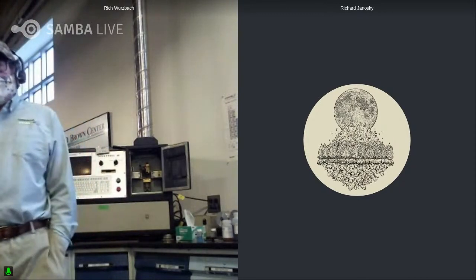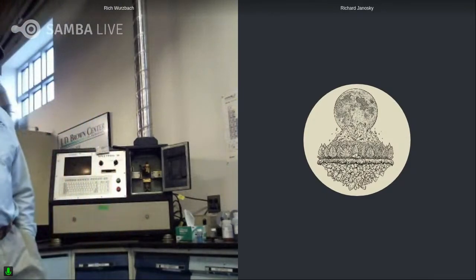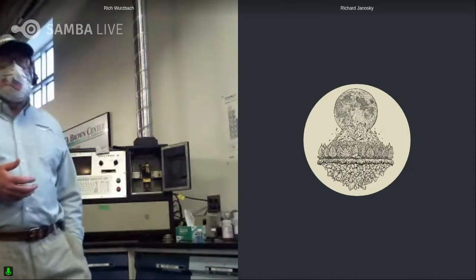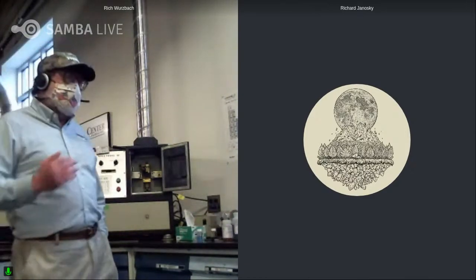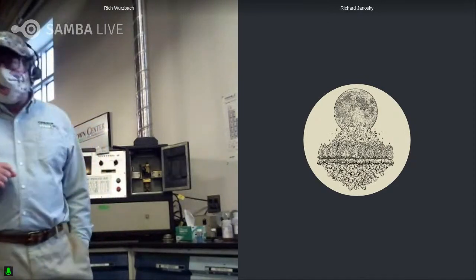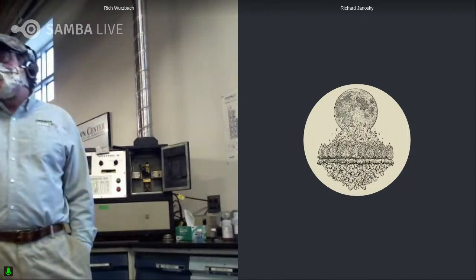So I'm just saying, be prepared to be in an imperfect world when we're relying on the selection of some solvents to help us prepare. It's almost like sometimes with ferrography, we have to peer around certain things that we didn't get fully dissolved and figure out what's the real stuff of interest, what are the real wear particles that we want to identify, evaluate, and so on.